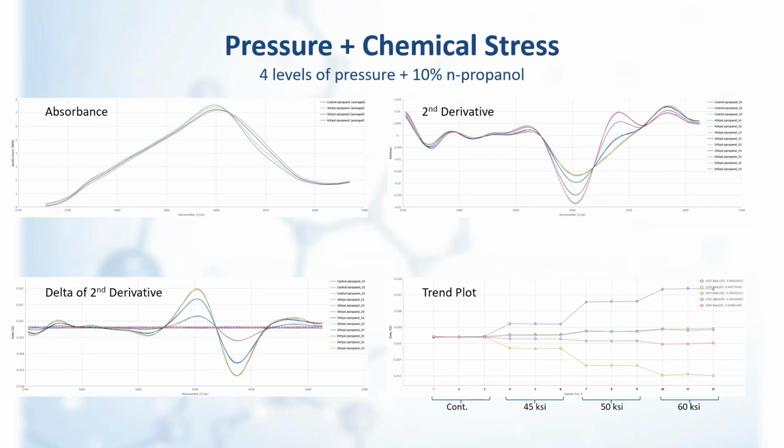Even more remarkable changes were observed in samples containing co-solvent. While samples of 3 replicates for every condition were essentially superimposable, each increase in pressure showed pronounced and proportional conversion of the parallel beta sheet into the antiparallel. Moreover, formation of extra alpha helical regions from turns was also observed, consistent with the literature data suggesting that aliphatic alcohol co-solvents are conducive to formation of extra alpha helical structures.